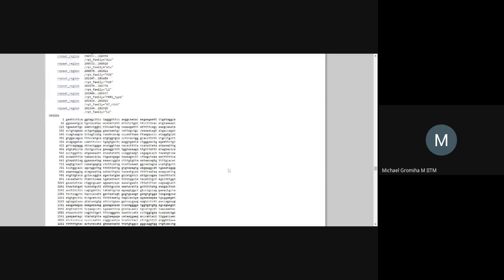Yeah, just go back a little bit. Yeah, go down. Okay, fine. So here you can see the full sequence. But GenBank did not give the number of ATCG, but in other databases you can see the number of ATCG and all. Okay. So, participants, are you able to get these pages and check the contents? Yes, sir.